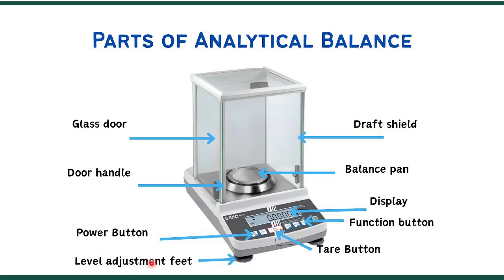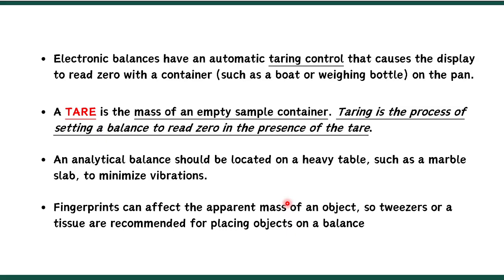And then we also have the level adjustment feet. This is where we adjust the height, the elevation, of our analytical balance.